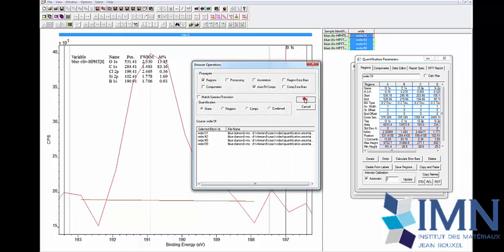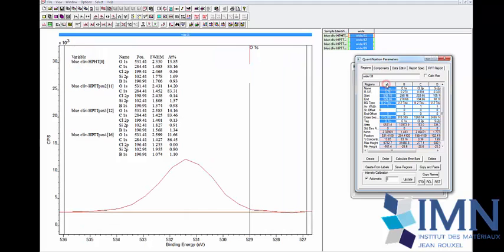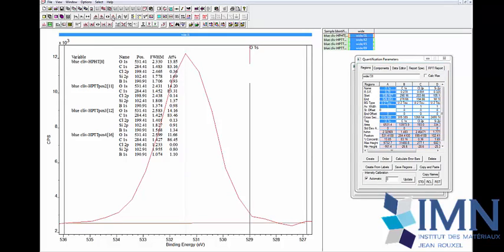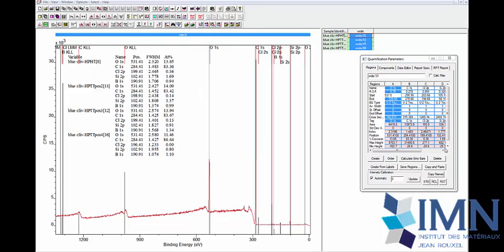So we want to propagate to other samples. It's done, and with this display we can see directly the 4 samples' results. Now we will check region by region, the oxygen 1s first, and we adjust the display windows to have a good view, and we adjust the limits left and right to have a good choice. The good choice has to be, in an ideal case, if it's possible, one that works for all the measurements together. It means when we modify one parameter, we are able to propagate it to the others in an easy way and have a kind of self-consistent measurement.